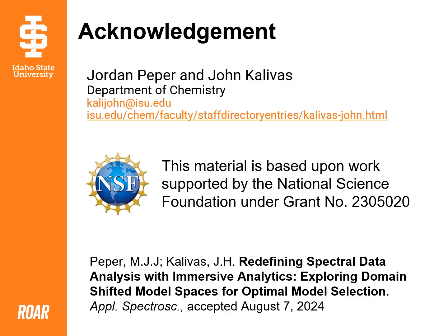So again, all the information on how we build the model, more details, and the model updating, and the different data sets, what the data sets are, and so forth, are all in this paper in Applied Spectroscopy. And there is a companion virtual reality movie that goes with this paper, and that's where we can touch the glyphs, and we want to be able to see the regression vectors, just actually visually see the model diversity. So we needed a way to represent this vector in a three-dimensional space, and that's what that VR movie is all about.